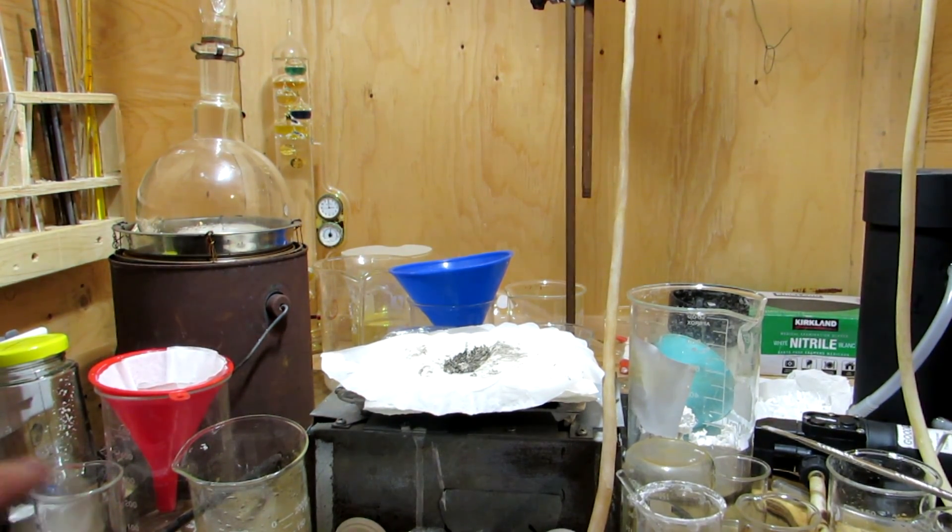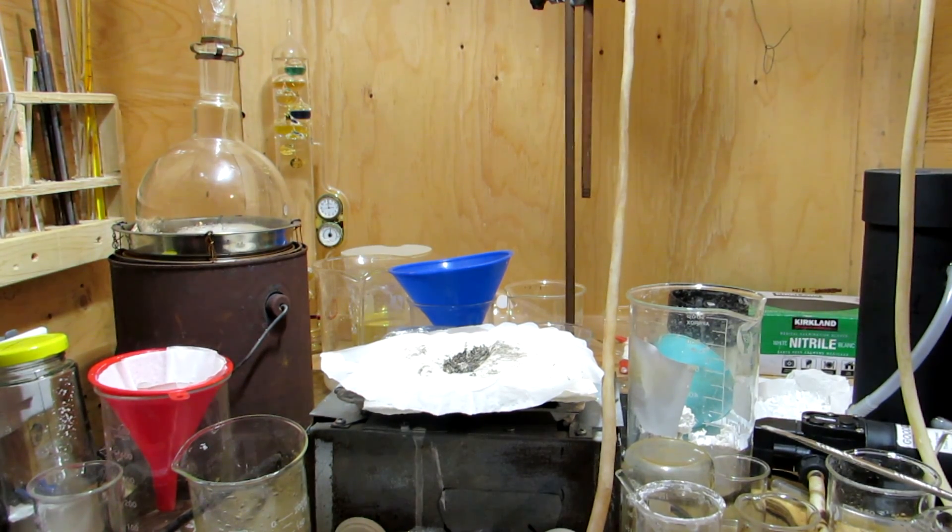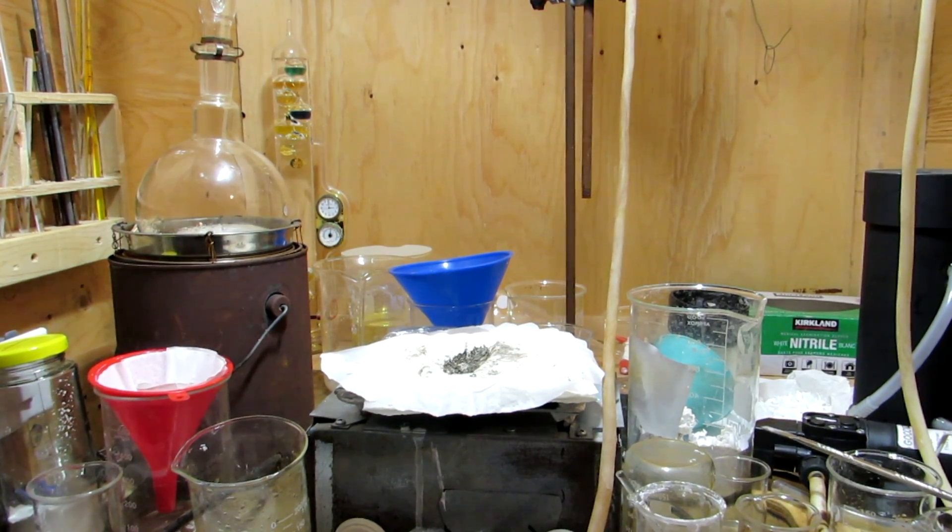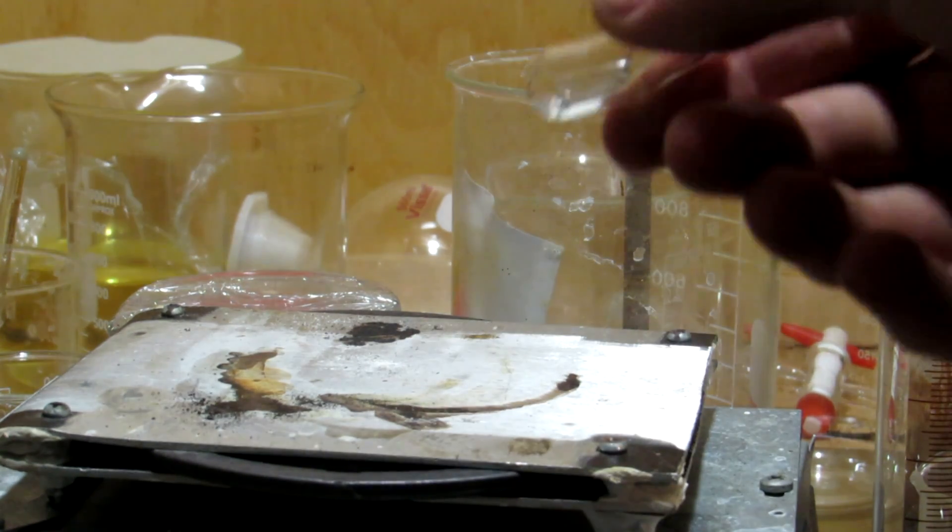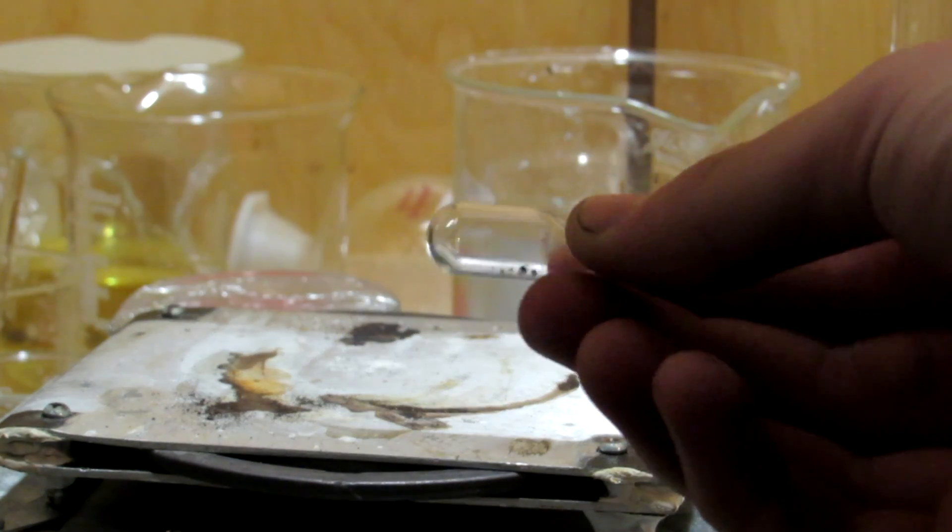There are some small blobs of thorium metal with some surface oxidation present in the residue, which had to be manually separated out. After removing the visible thorium pieces, the metal was sealed in an evacuated ampule to prevent atmospheric oxidation of the thorium.